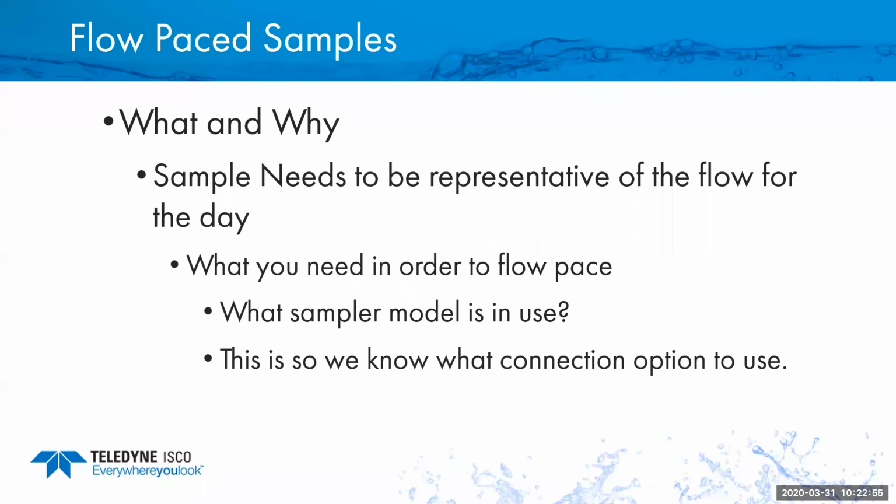You need to know more than just that I want to take a sample every 15 minutes. The things we need to know to accomplish this, number one, is what sampler you're using. We usually need to know this so we can figure out what type of connection options to use to bring your flow signal into the sampler. If you're using a flow module, that's all built into the sampler, and then you don't need any connections or cables like that.